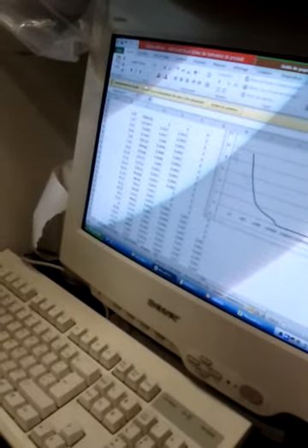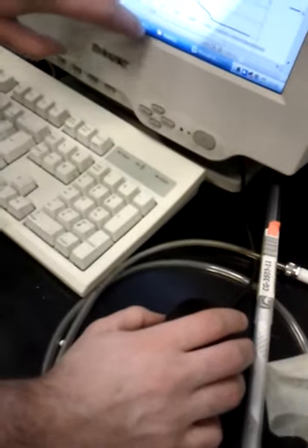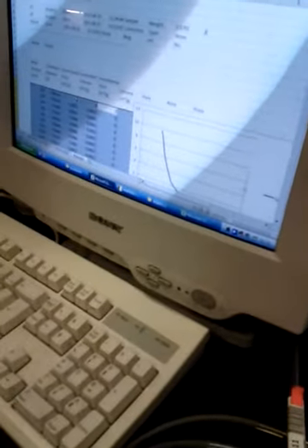Oh, I put the incremental volumes. That's what I want. Okay, I'm supposed to have the incremental. It's not incremental, it's cumulative. So this is the size of pore, yeah? Yeah. And what's this one? It's supposed to be the incremental, but it's not the incremental. It's probably the cumulative, or maybe it's kind of a mistake. I think there, but it seems to be cumulative and not incremental. The incremental is this one.